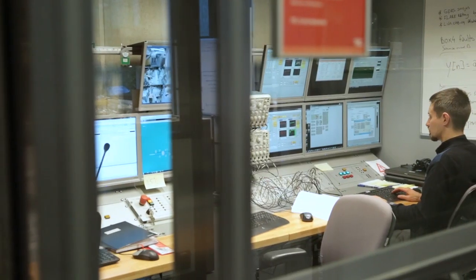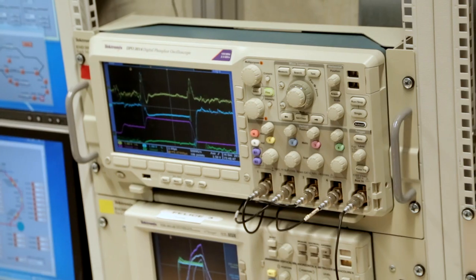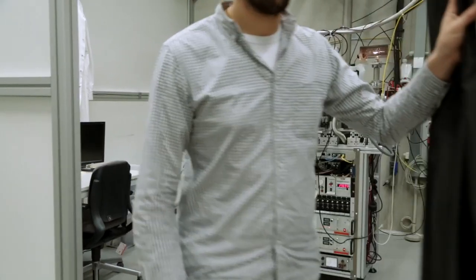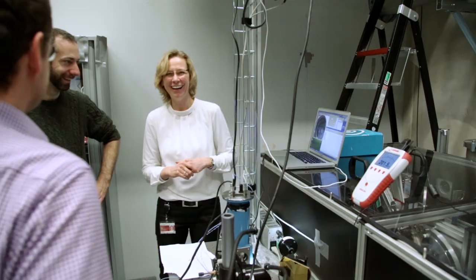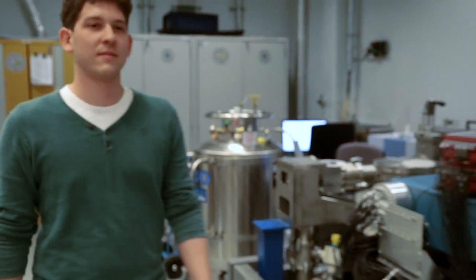Together, technicians, engineers and scientists working at the FELIX laboratory push technological and scientific boundaries. They provide free and open access to their facilities and attract top researchers from all over the world to the Netherlands. In this way, FELIX and all its users contribute to a better understanding of our world and the molecules and materials it exists of.